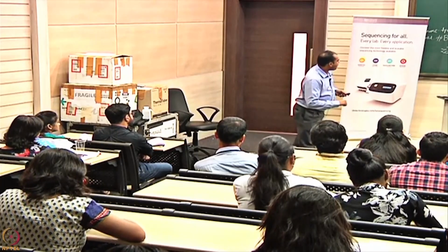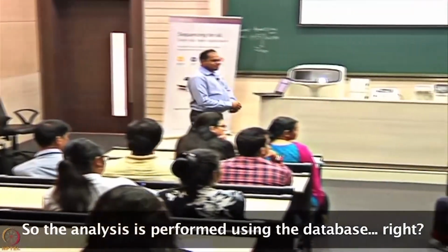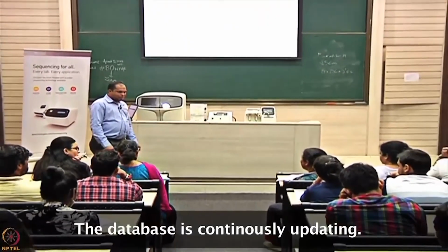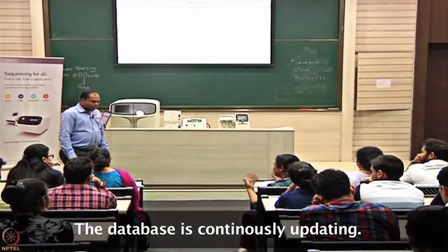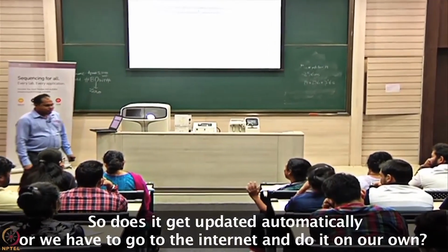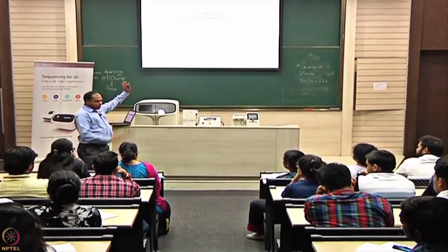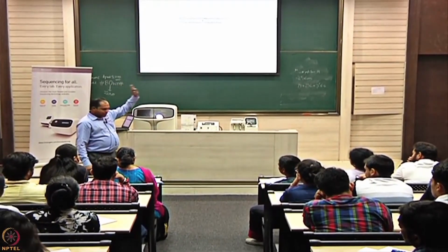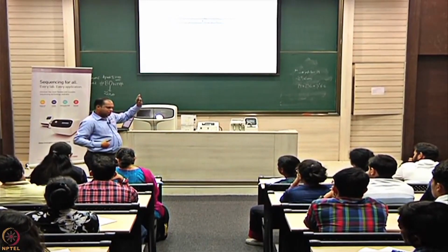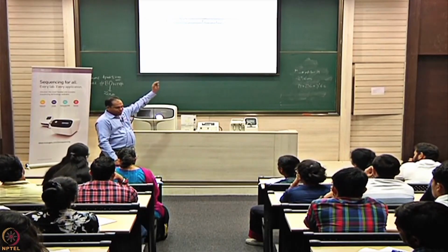Yeah. So one question. When we align with the database, the database is continuously updating. Is it preloaded, or do we go through the internet? For the software that is online, it is already updated. Whenever there is an update coming in, every 3 to 6 months, that gets updated onto the cloud system that we have.